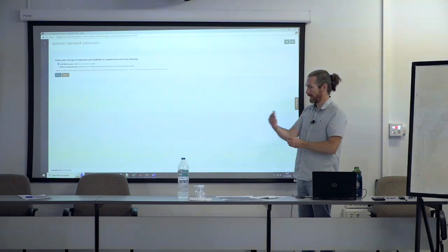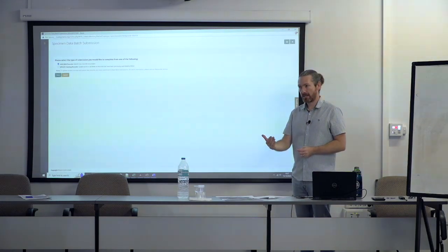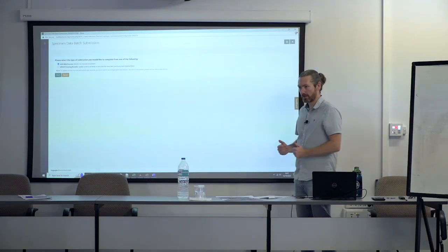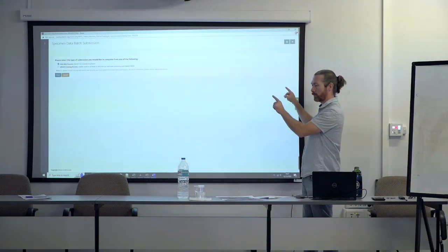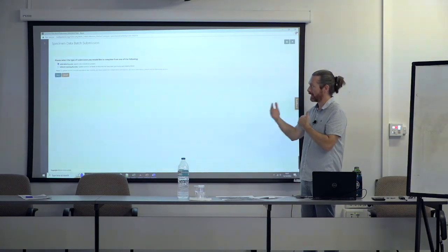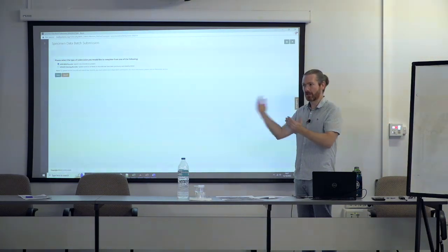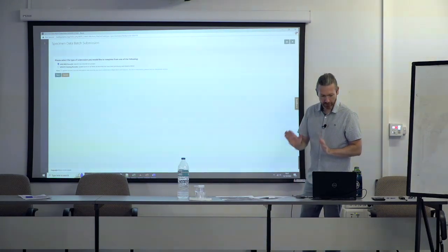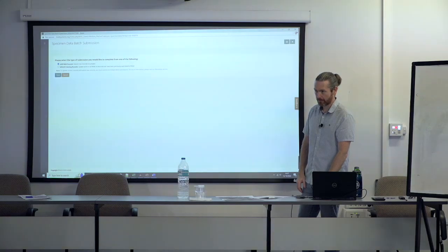Unfortunately, the mechanism we have to use with all the custom data is that you first upload the standard data, then you have to download the sheet. It now has all the fields for the custom fields, and then you have to fill those in and re-upload it. And that is not a very safe way of managing a lot of data. So that needs to be resolved. So that's just flagging: if you are updating records, just really be careful with your spreadsheets.